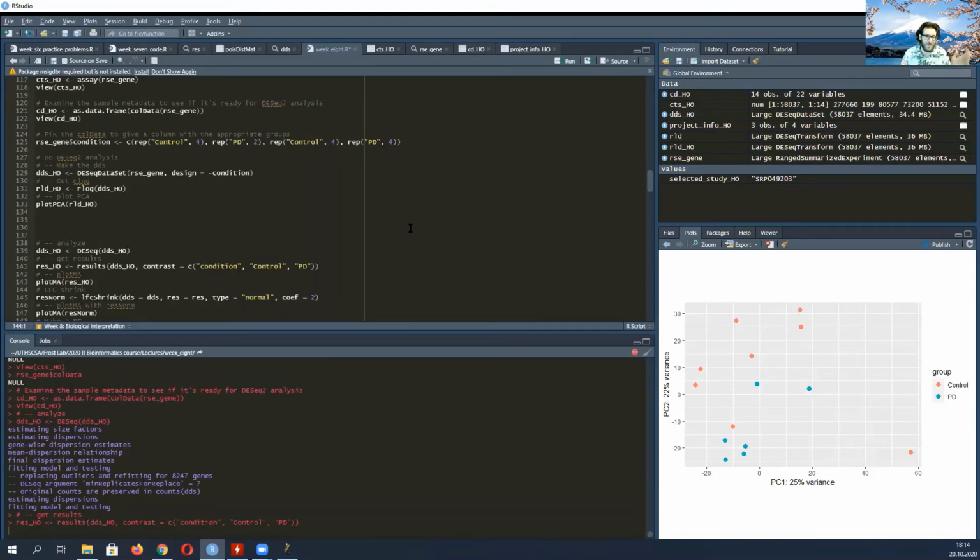Right. So great. I think for the PCA, you probably want to use all the annotation, and after you've done the PCA, you may just do the design and put in whatever is necessary. So it's always good to see the raw data to begin with. Then if you want to remove the sporadic and also the non-PD, you do that afterwards, so that you can clearly see the difference.